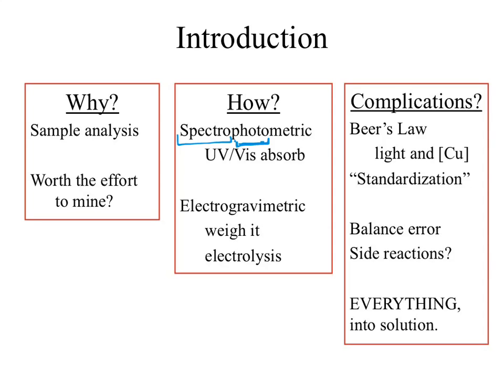A picture, so we're looking at a spectrum picture. What we're going to do is see how our individual sample responds to light. Ultimately we're going to be taking a picture of our sample across a broad spectrum of light, and the hope is that we could then correlate that back to something useful, i.e. the concentration or the amount of copper within the sample. The metric is ultimately just measuring.